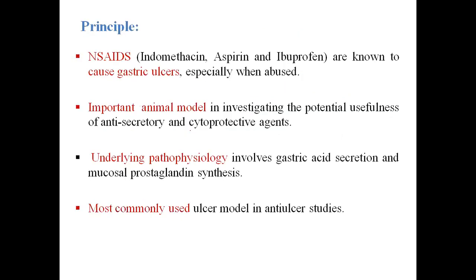Okay, now I'm moving to the principle. See, in case of principle, NSAIDs, various examples are available like indomethacin, aspirin, ibuprofen. So anyone you can take to induce the ulcer. Only the condition is it has to be used in proper excess dose. So if they are in excess dose, then only they will induce ulcer in animals.